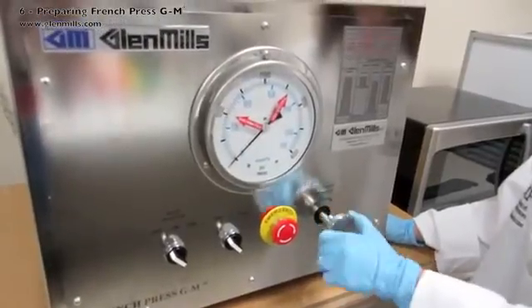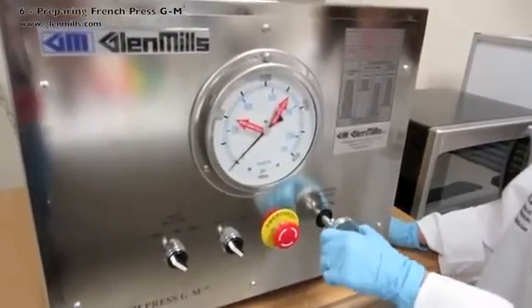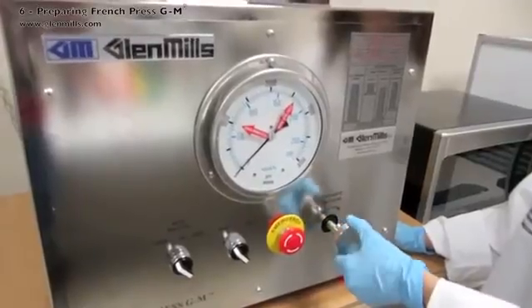Turn the pressure increase valve counter-clockwise until fully open. It is good practice to then turn it one quarter turn in.